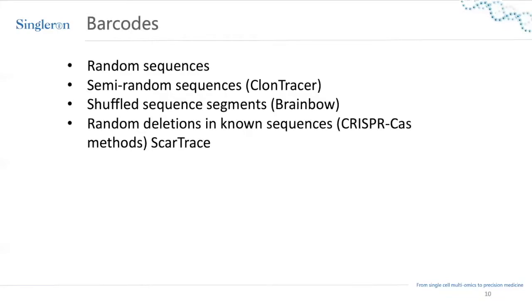So now we talked about the FASTQ file. This is what you get from your sequencer. This is also common to bulk RNA and single cell RNA. As I said, single cell RNA has two features that are important. Barcodes is one of them, and UMIs is the second.